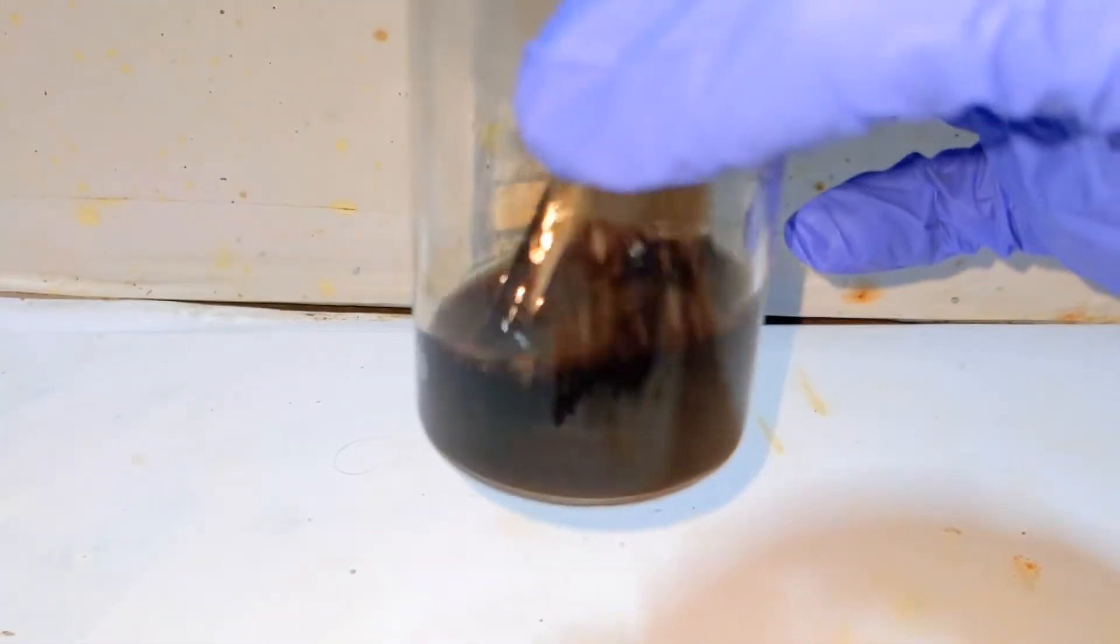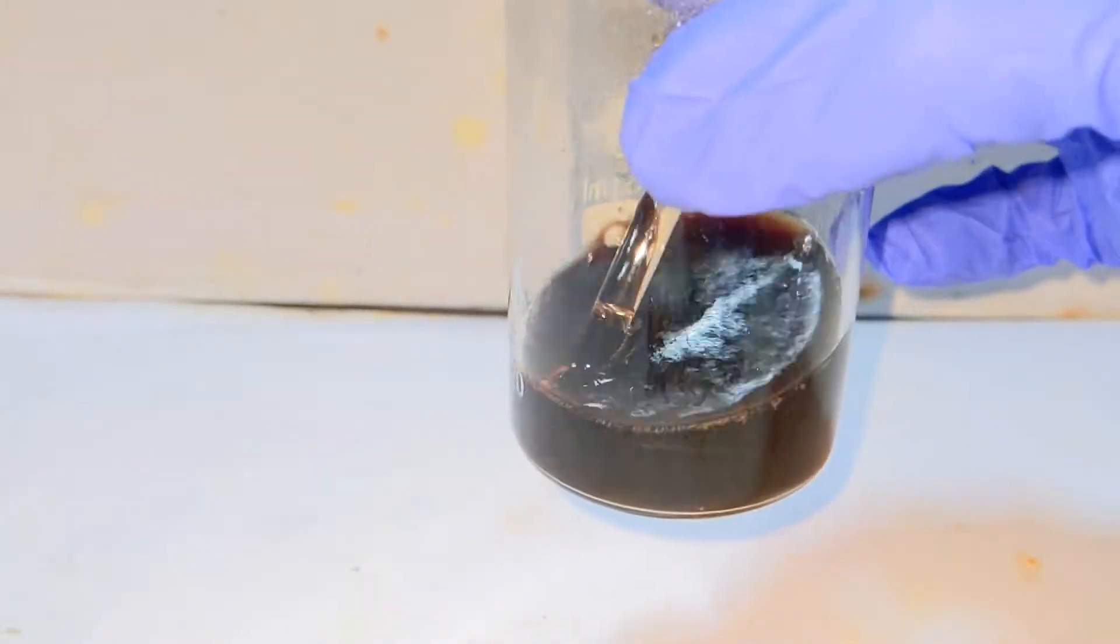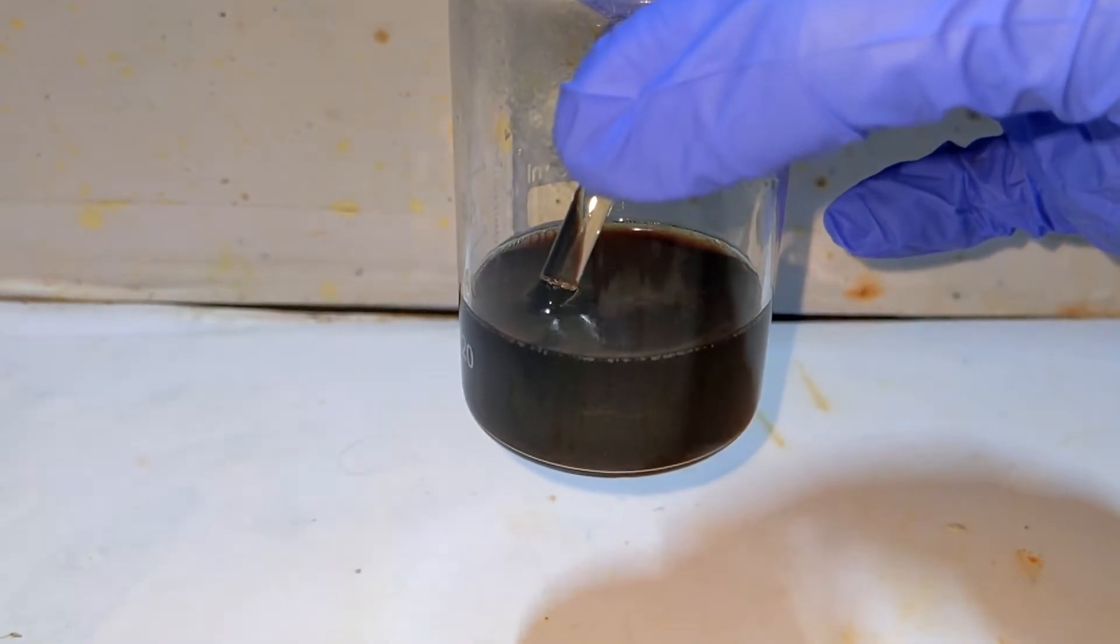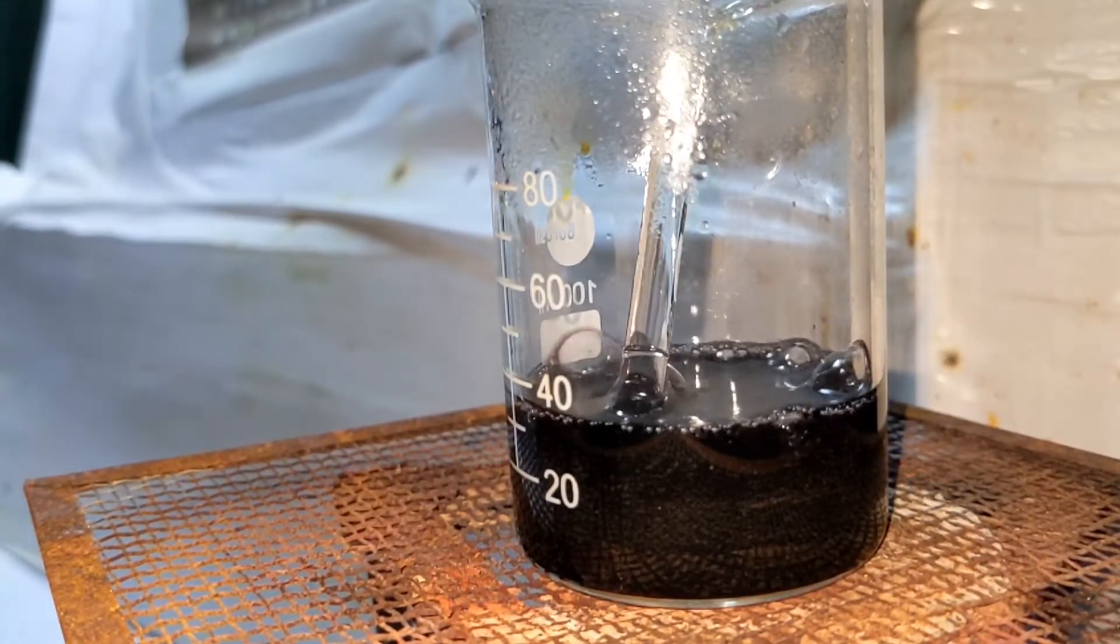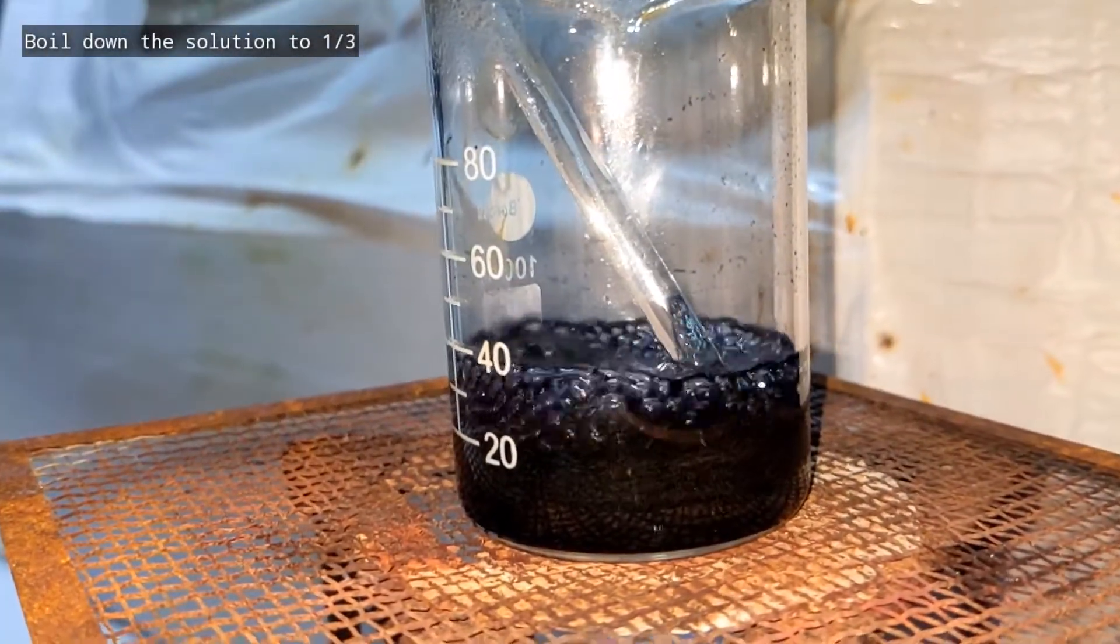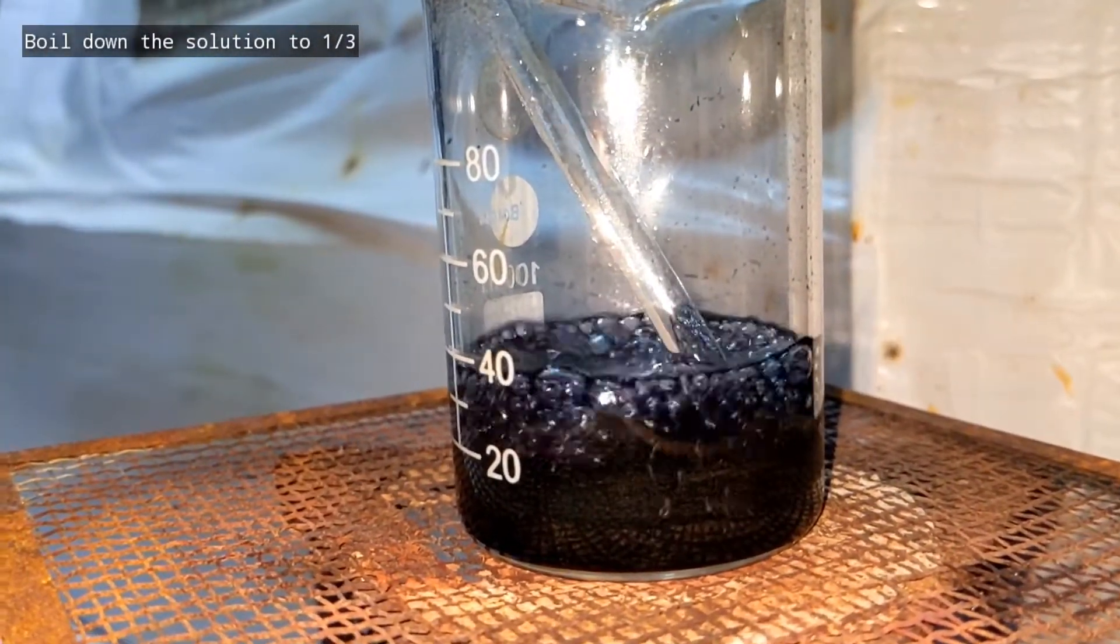Once all the dichromate addition is complete, the solution was boiled down to about one-third of its original volume and then allowed to cool down to room temperature.